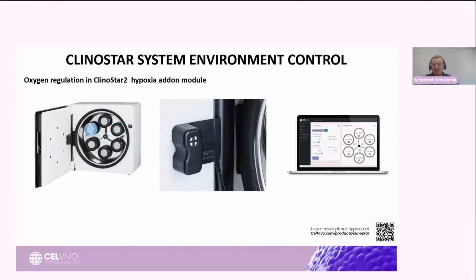But actually, one of the big reasons why we decided to move to ClinoStar 2 from ClinoStar 1 was the increased computing power and ability for those new functionalities. If you think about the recording, right now it's not done, but those who have ClinoStar 2 will get the update. We also keep on upgrading the systems, and that's why the new button and functionality will come to the cloud. I cannot say exactly when, but not in the far future.